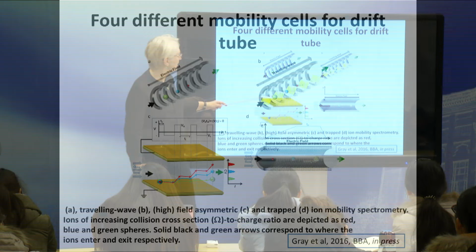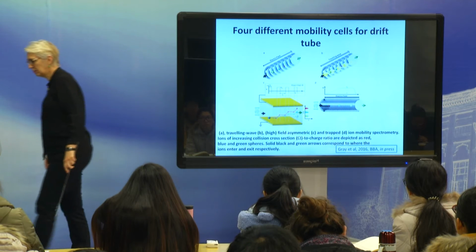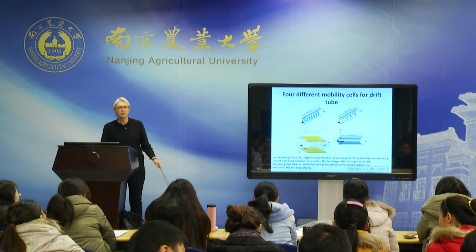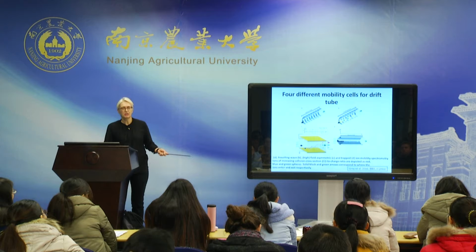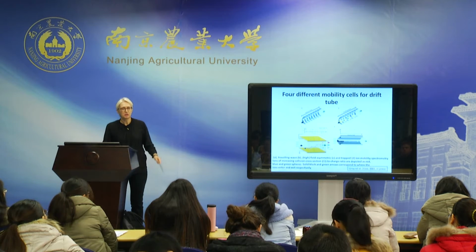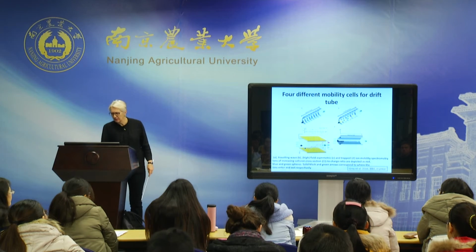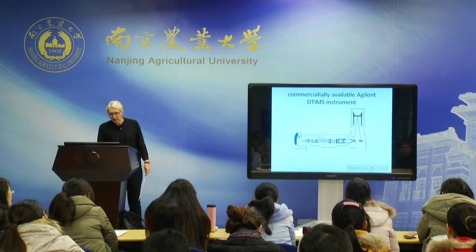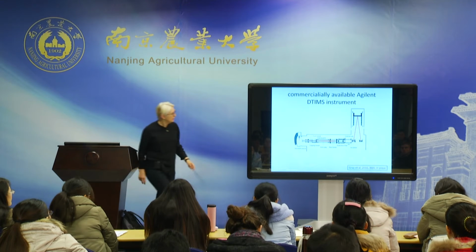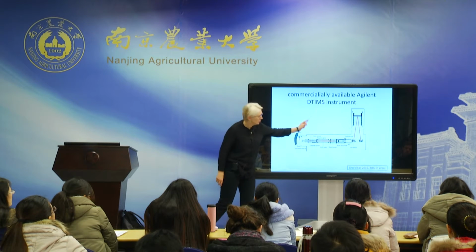So they're different conformations. As I said, this technology is not new and has been around for quite a long time. And actually, we're using it increasingly, and I'll talk about it on Saturday as well, for other bioanalytical applications, because it's very insensitive to impurities. So it's a very nice technique to integrate. There's an Agilent instrument. Again, so you see they've just integrated the drift tube into this whole setup.